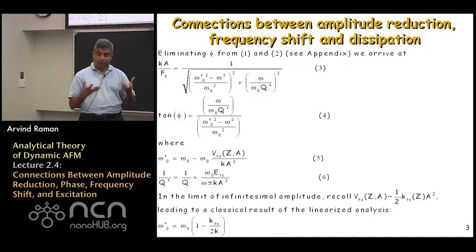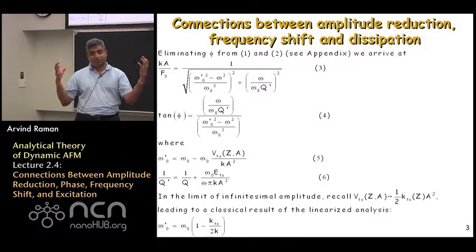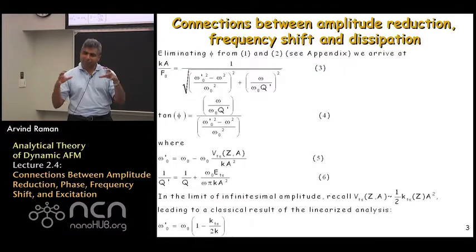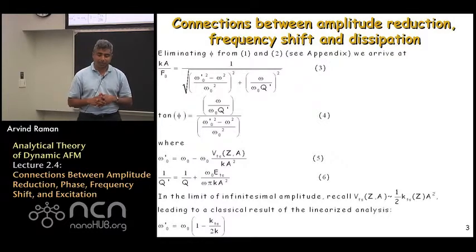Both of them make their way into the denominator of equation 3, telling us that you can think of the resonance response in the following fashion as shown in equation 3, very much similar to what we derived for a directly excited cantilever some time ago.